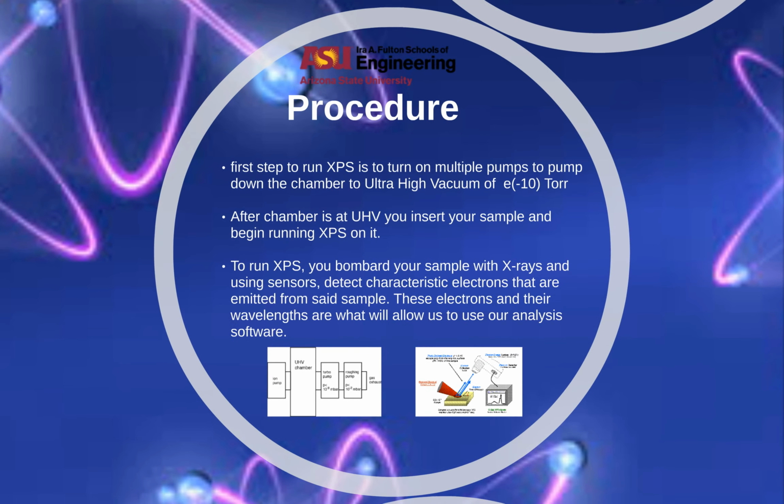The main chamber reaches about 10^-10 millibar, and the preparation chamber reaches about 10^-9 millibar. Reaching 10^-10 millibar does not just take overnight. On average, ultra-high vacuum takes around 3 days of constant pumping. The sample is inserted into the preparation chamber before it's pumped down to 10^-9 millibar.